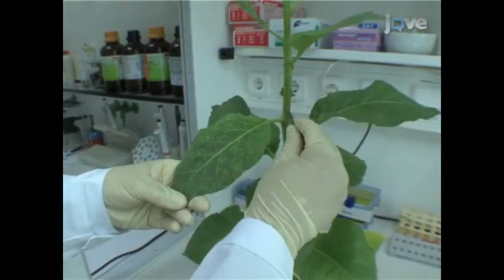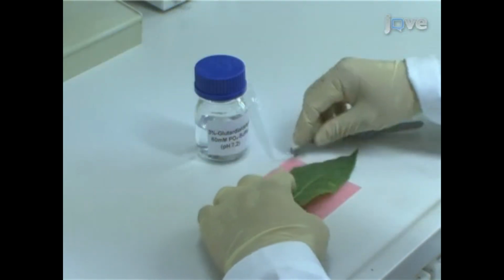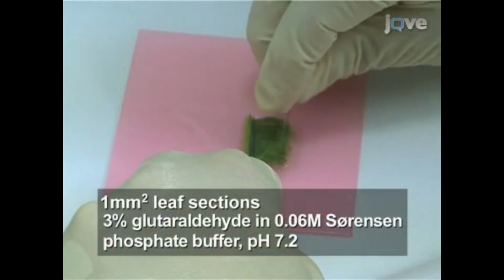Next, cut out small sections of leaves from Nicotiana tabacum infected with tobacco mosaic virus, or TMV, with a razor blade on a modeling wax plate in a drop of glutaraldehyde in Sorensen phosphate buffer at room temperature. During harvesting of the samples and loading of the samples into the baskets, it is important to make sure that they are always covered with fixative solution so that they do not dry out.